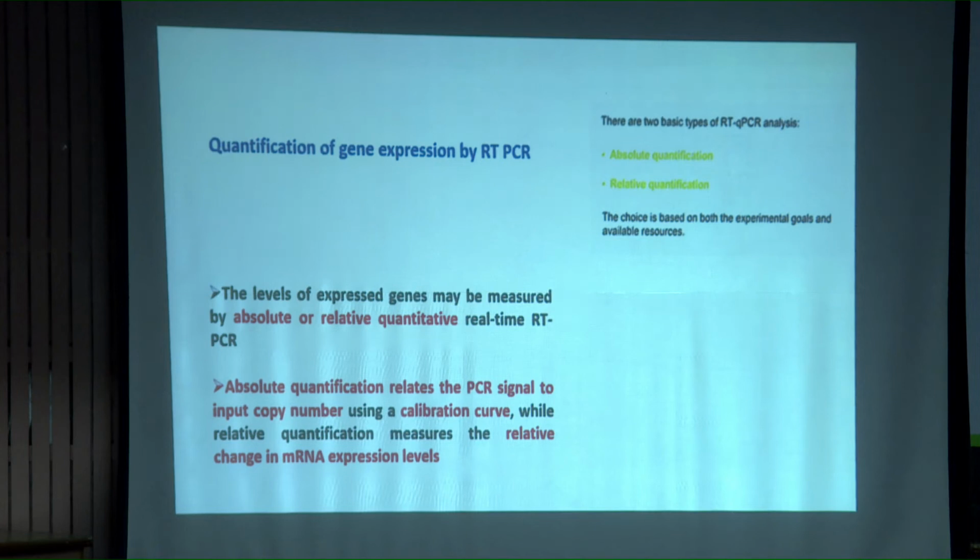Now, having said that, let us take a look at the intended objective of the qPCR. There are so many applications of qPCR. I'll take one application here, that is changes in the expression of a gene in fungi. Another application is when you want to estimate how much fungi is living in a particular ecological niche. Let us say you take a leaf, and you don't see any symptoms, but you believe there is some fungi living there.